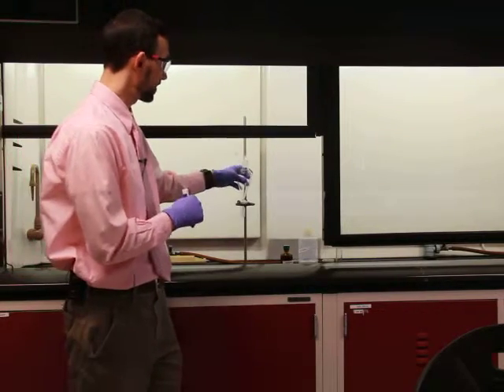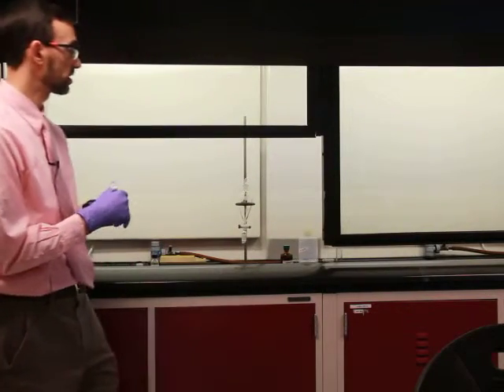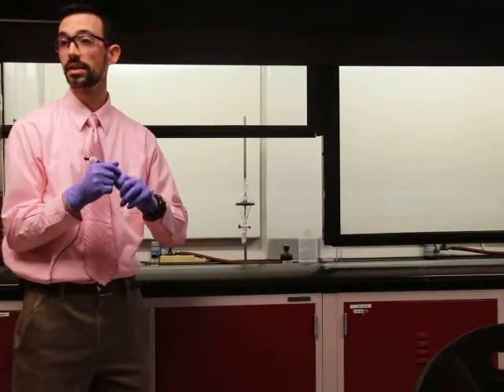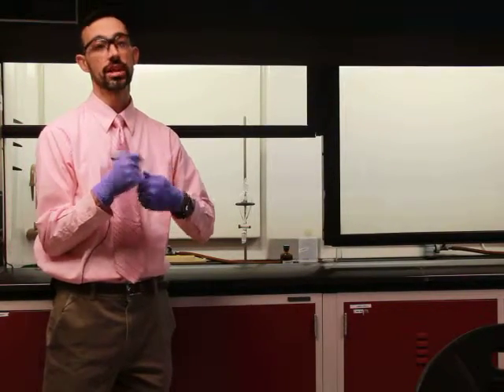The premise of extraction, solvent extraction, is based on what we've learned in chapter 12 about solutions and the solubility that each chemical has.